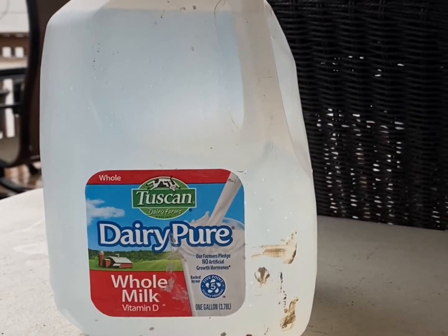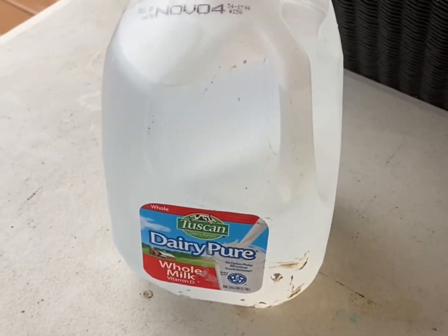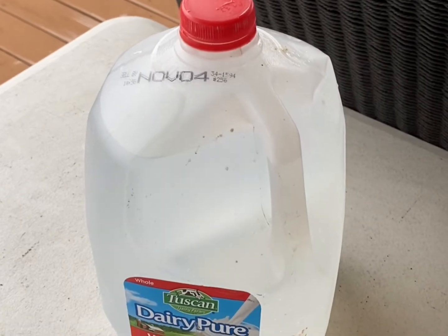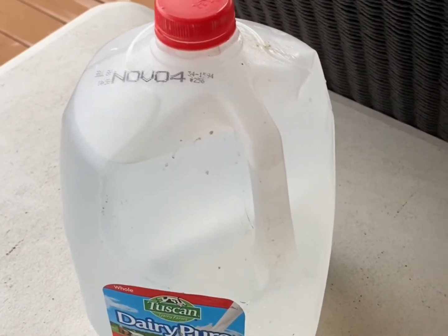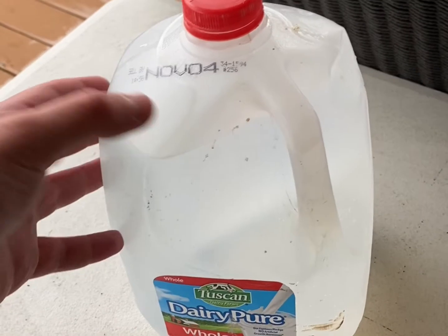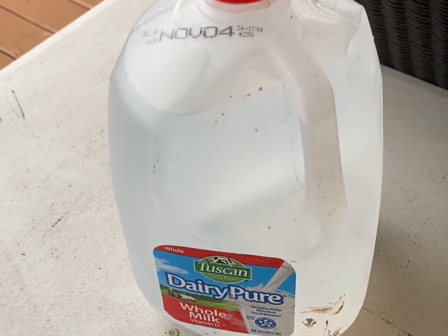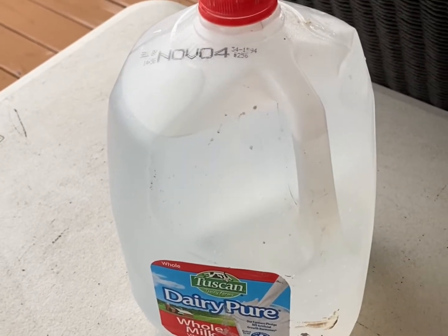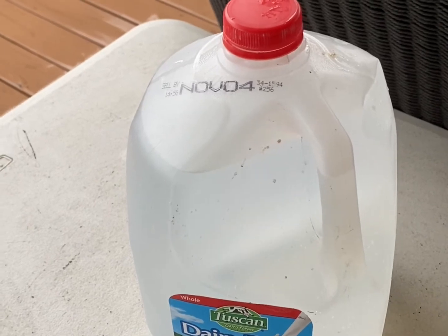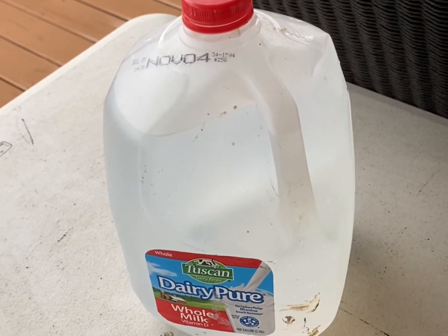Now, for anyone that's curious about how you get rid of the waste, because you're not supposed to pour chloroform contaminated water down the drain, because chloroform is a pretty nasty carcinogen. Chloroform degrades in alkaline conditions to sodium formate, which is benign. So you just pour the water from the bleach bottle into another container, or back into the bleach bottle. I just had another container laying around, so it was easier to put it back into it. And you let it sit for a couple of weeks, and it'll degrade, and then you can put it down the drain. So it's easy as that. Or you can put it in a sodium hydroxide solution, or something like that. If you have just regular chloroform that you don't want anymore, a sodium hydroxide solution would probably be better. So that's for anyone who's curious about how to get rid of chloroform waste.